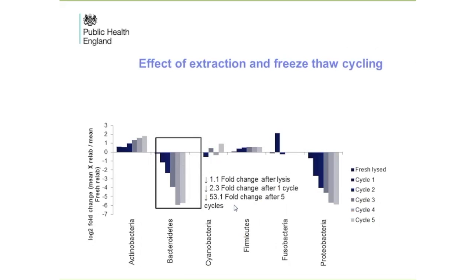That leads, the bacteria are normally abundant at 32% within a sample. After the completion of 5, then the recovery we had was less than 5% abundant within each sample. What complicates the problem is then you start, because you are looking at the abundance within the reads, it skews the data.